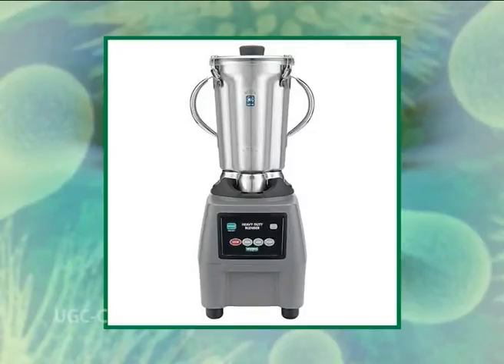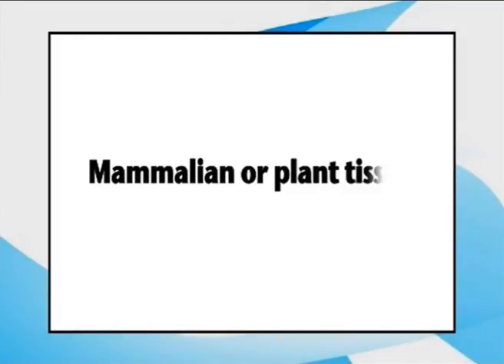Cutting. High-speed mixers such as Waring blenders are also used. Disruption of cells occurs due to immense shearing force generated by the fast rotating blades. Tissue is cut into small pieces and blended in presence of buffer. This method is ideal for disrupting mammalian or plant tissues.